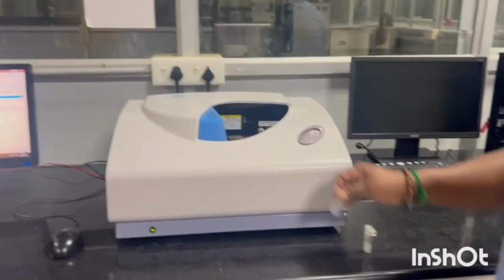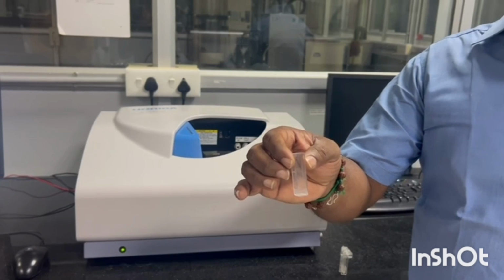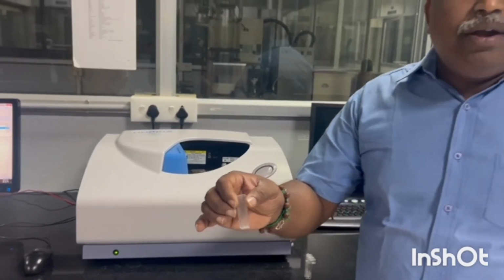If you look at the instrumentation, there is a laser source which passes over the sample. Normally we keep it in a cuvette, a 100% transparent cuvette. Here you have to consider the sample preparation. Generally we go for a dilution factor of 1:100. Then we keep them in a water bath for complete dispersion of the particles. Then only you get good results.